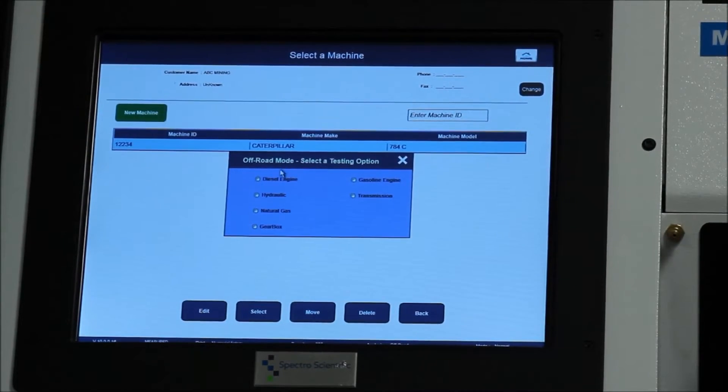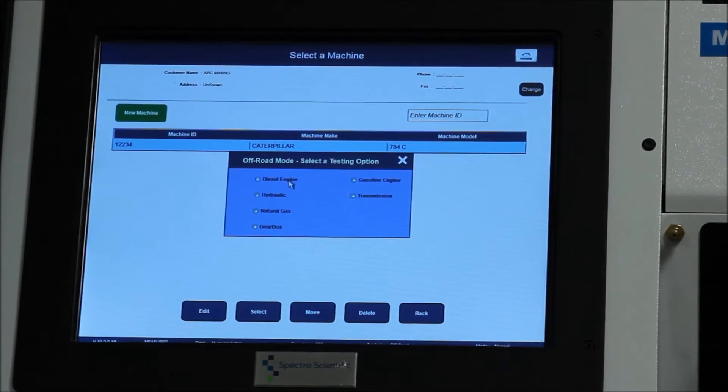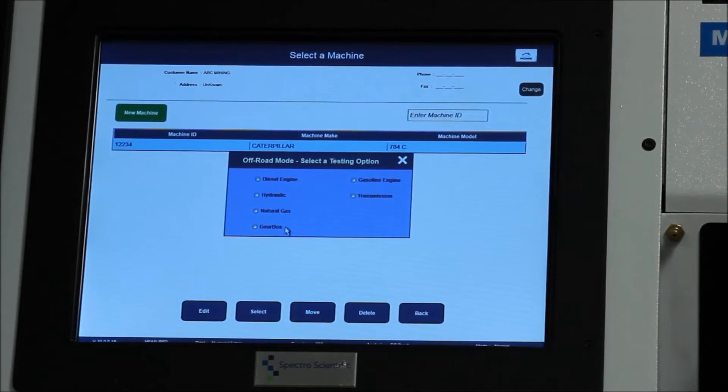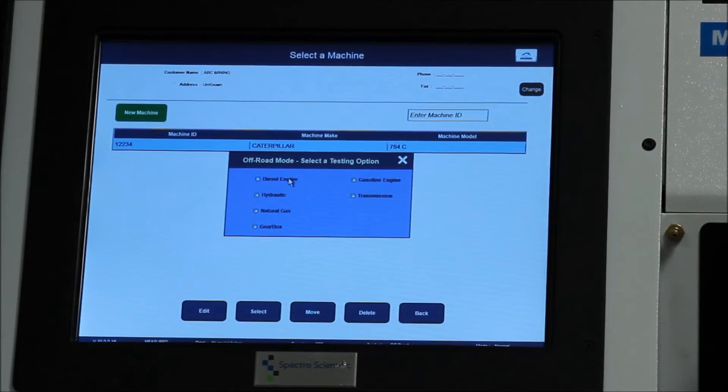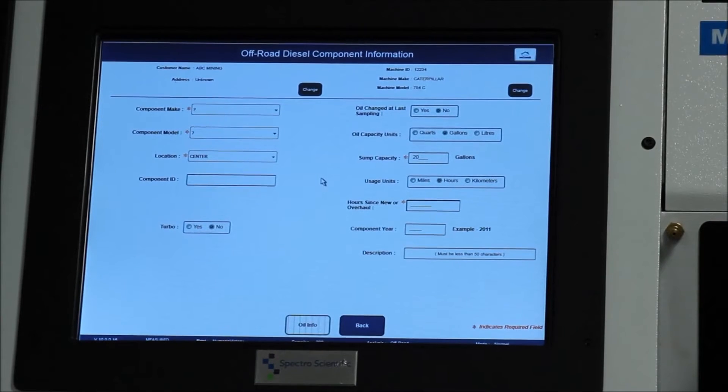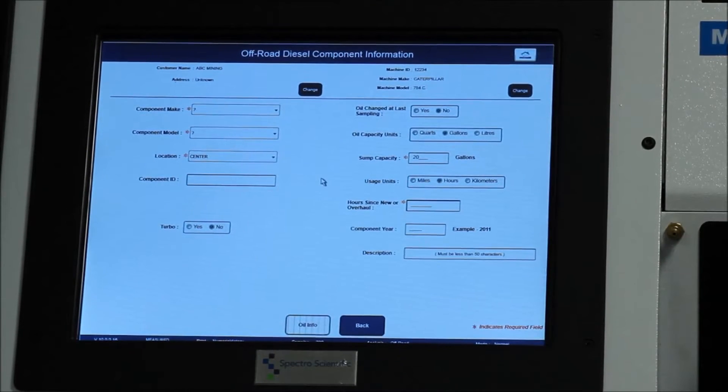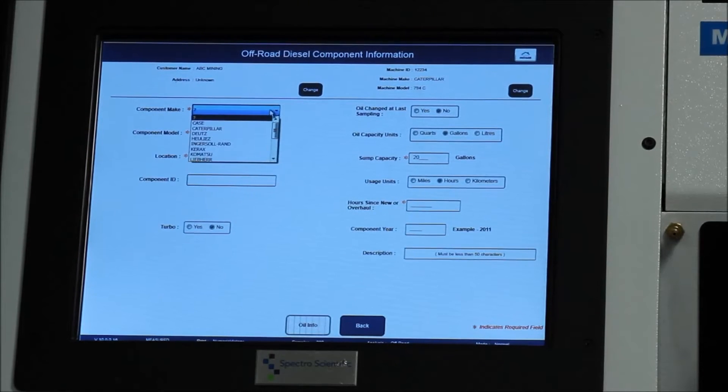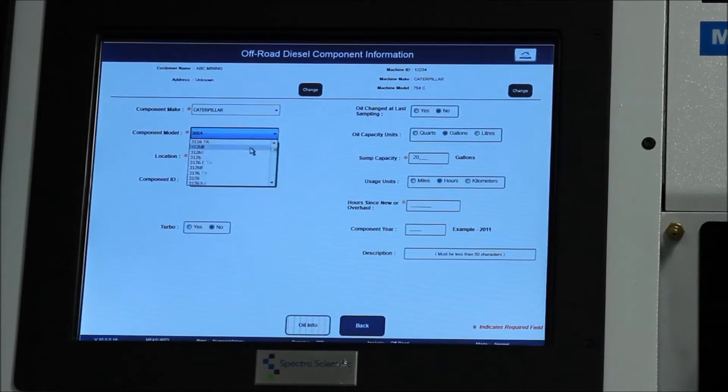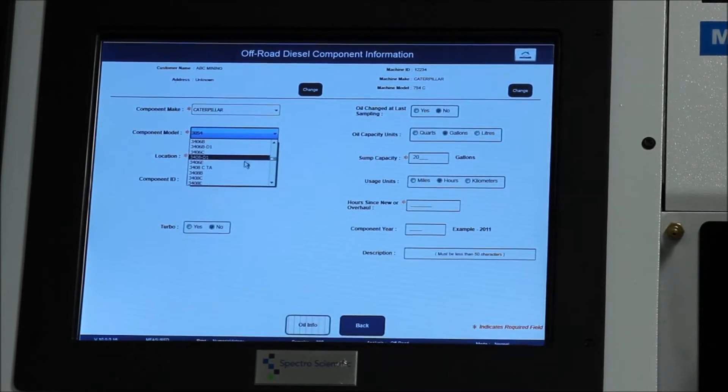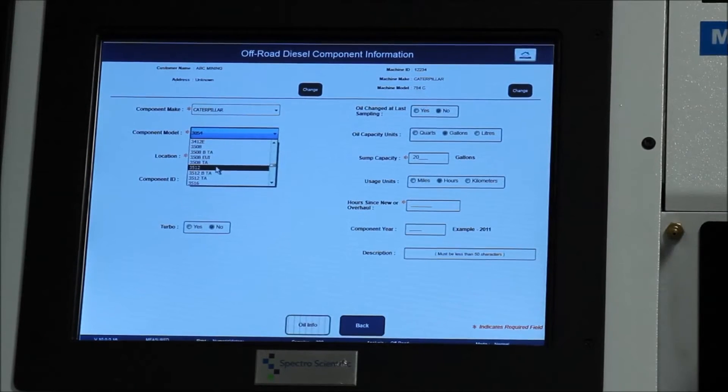Next it wants to know within that vehicle, what component are you testing. In this case, we're going to choose diesel engine. It also gives you the option of hydraulics or transmissions, just the other components that are on that equipment. Next it needs information about that particular component, about the engine. So for the make, we're going to again choose Caterpillar. And for the model, we'll choose 3512 and again scroll down until you find it or start typing it in.